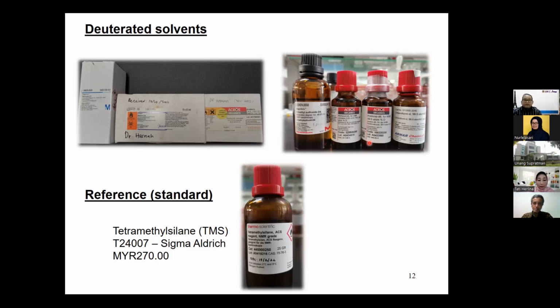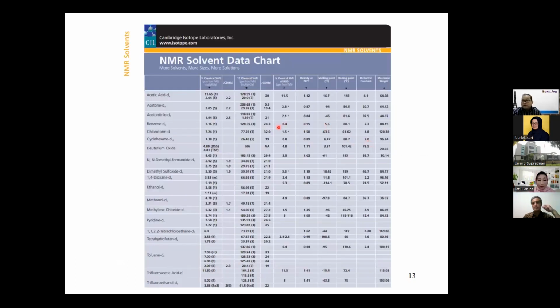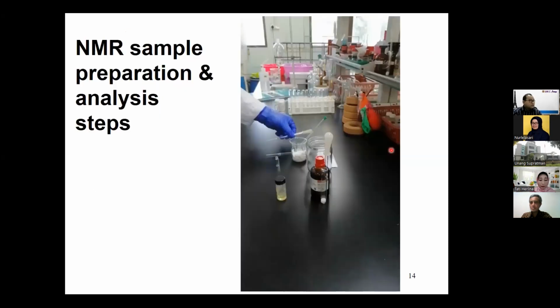So this is the NMR solvent chart data. I think I already provided this information to Prof. Unang to distribute among the students. Anybody who is doing research, I'm not sure for the S2 level in UNPAD, if you have some mini project, for example reading NMR data, you need this NMR solvent chart, because I already advised my students to have at least one of their own during NMR analysis. So I'm preparing the video for NMR operations. I think I can play it.